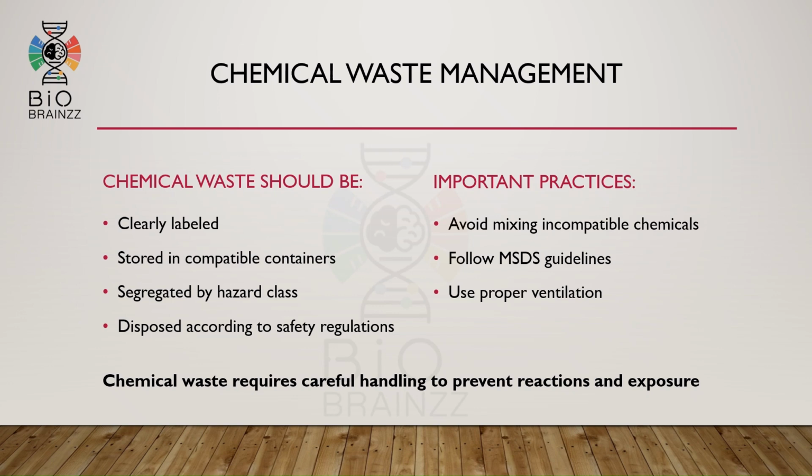Chemical waste should always be clearly labeled and stored in compatible containers. It must be segregated according to hazard class and disposed of according to laboratory safety regulations. Laboratory personnel should avoid mixing incompatible chemicals because dangerous reactions may occur. MSDS guidelines and proper ventilation systems must always be followed during chemical waste handling.